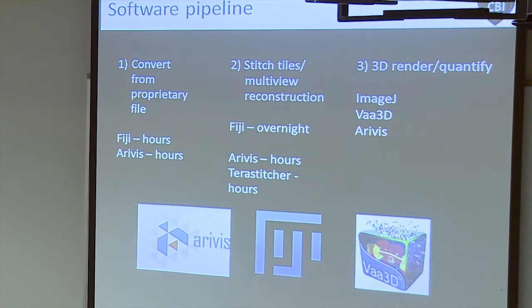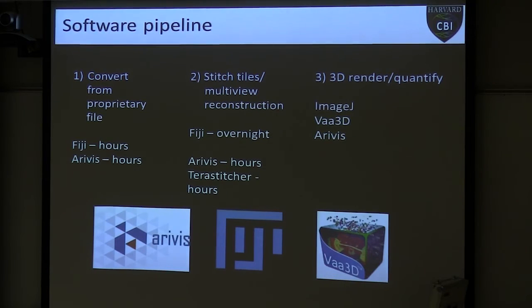Fiji likes to load everything into RAM. Obviously, you don't have 10 terabytes of RAM on your computer. So you have to do it in virtual stacks where Fiji is just loading in a single image at a time. And that takes a long time.